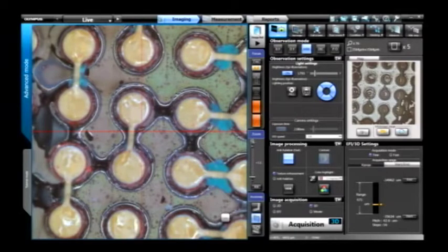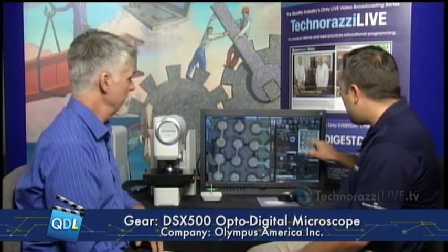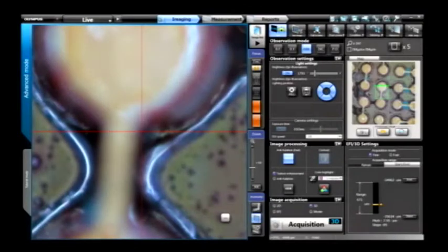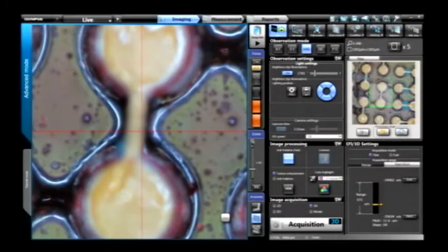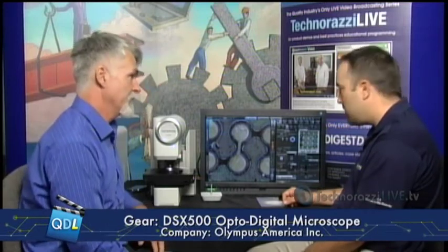You can also import the large stitched area as a map image. If you do a quick stitch of an area and want to move around, you can drive through your map — there's a little green box on the right-hand side showing where you're zoomed into on the entire stitched image. You can move this to any position and the stage drives right to that position. The interface is very simple: up top you have three major functions — imaging, measurement, and reports — each bringing up a contextual screen.